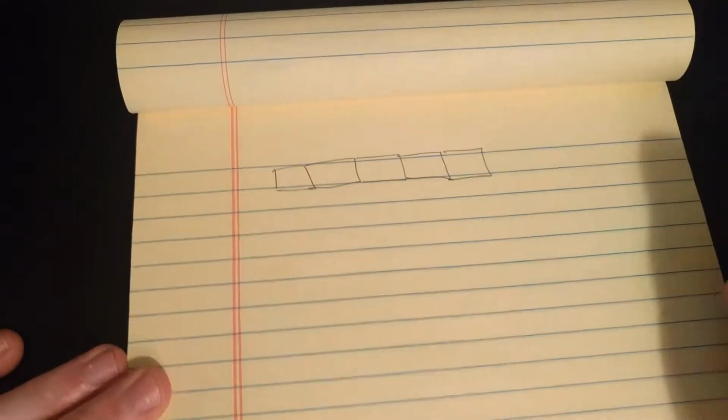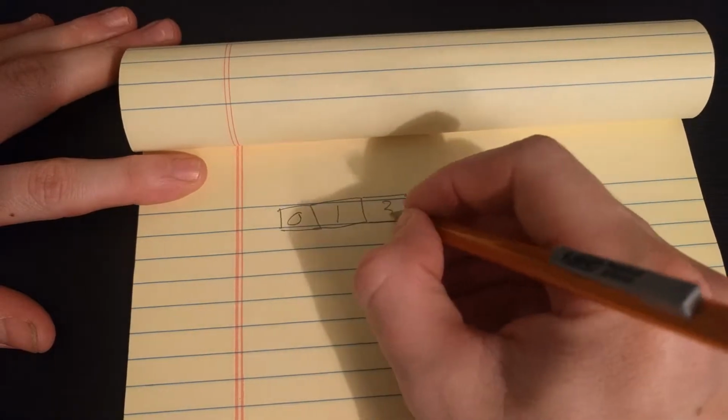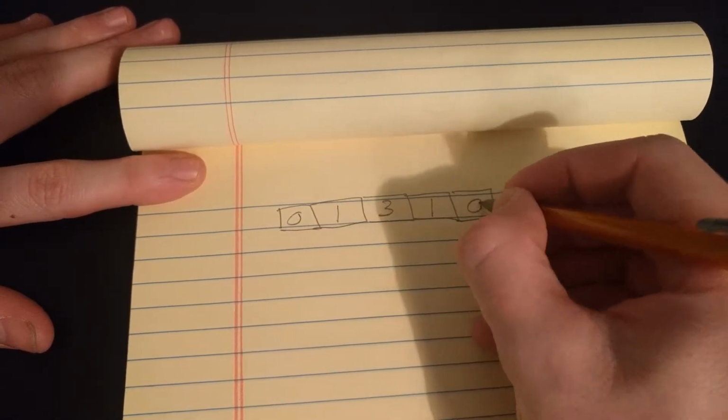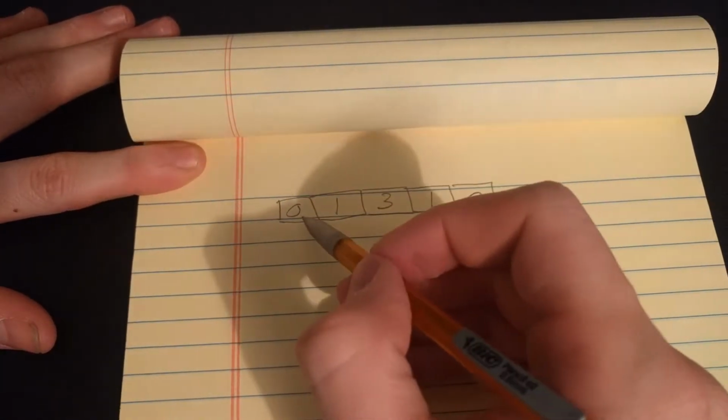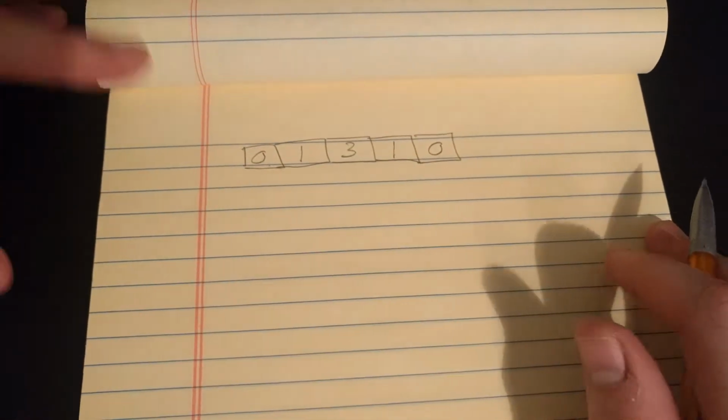And each of those different bits of information we can sort of map onto a pixel. So if we have 5 different pixels, our first intensity at 1700 was 0, our second was 1, our third was 3, our fourth was 1, and our fifth was 0. And each of these little squares can be sort of thought of as a pixel.